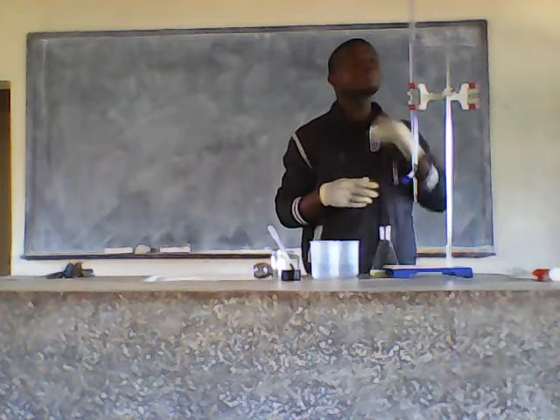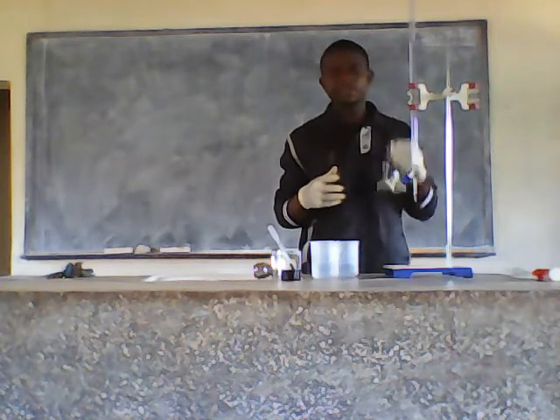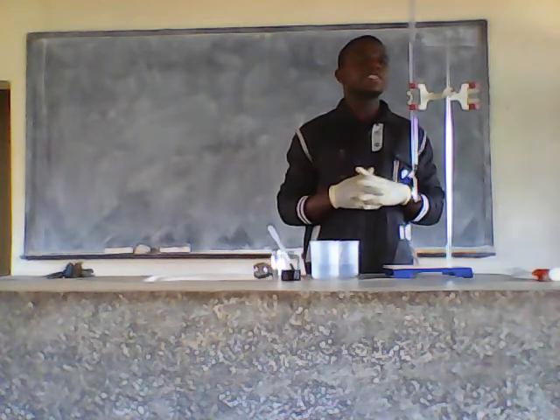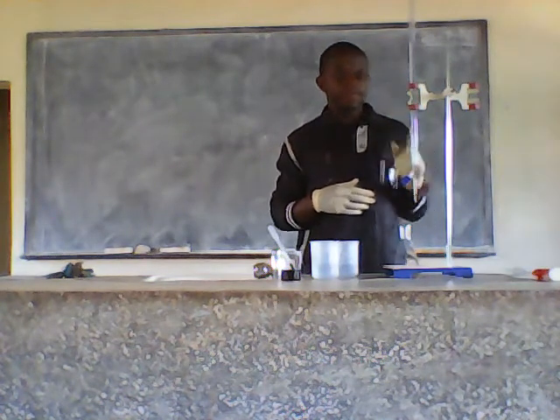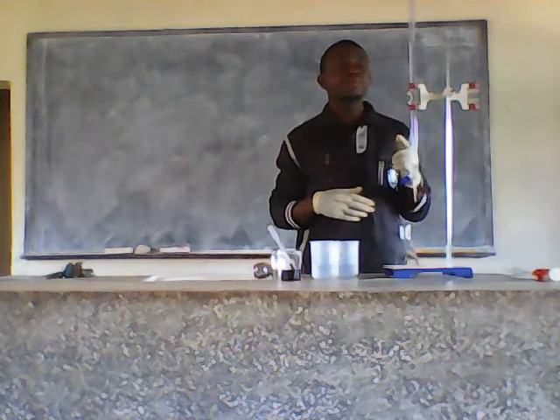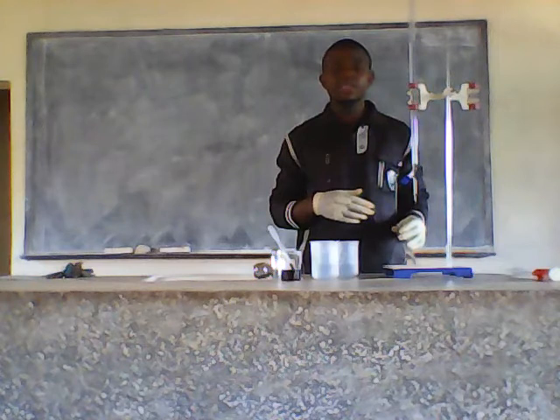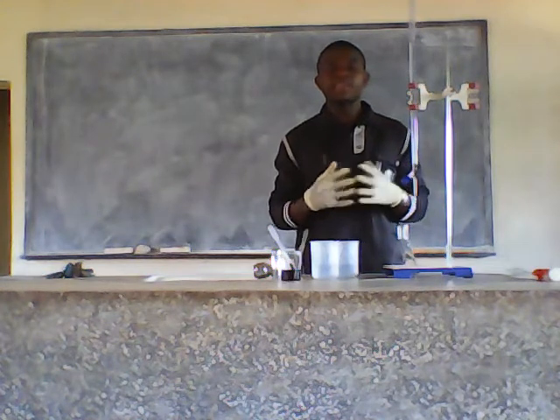So here I'm going to get the volume of acid that has just reacted with the base. My volume on the burette is 17.5 mL. So for this experiment, I have found that 17.5 mL of the acid in the burette reacted with the base. That's all about this experiment. Thank you very much.